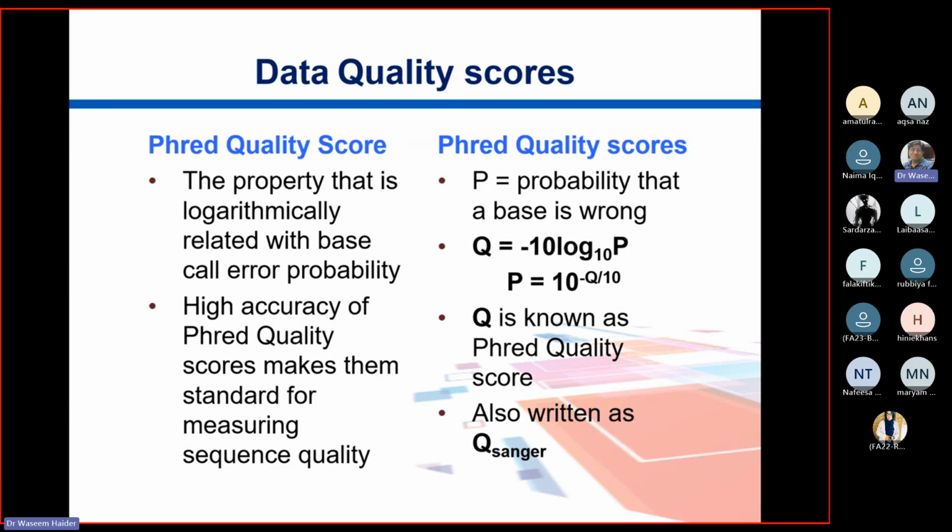Obviously, it will not affect the quality very much, right? But what about 5,000 among them saying some different color or giving us some different nucleotide information, and half of them are giving another. So in that case, this 50-50 thing is quite confusing. So obviously that quality is really low.